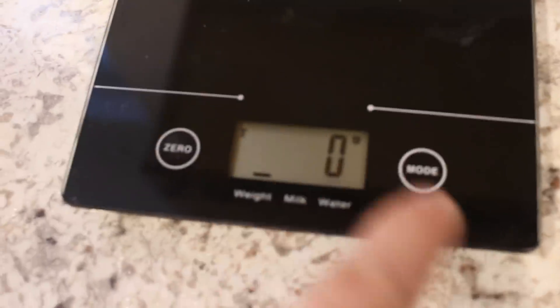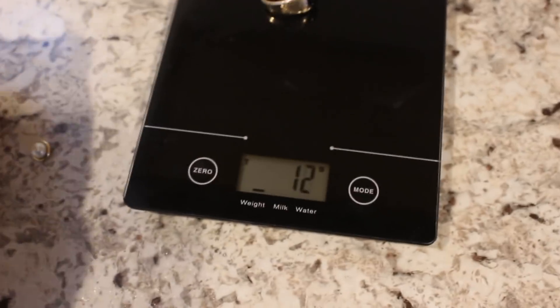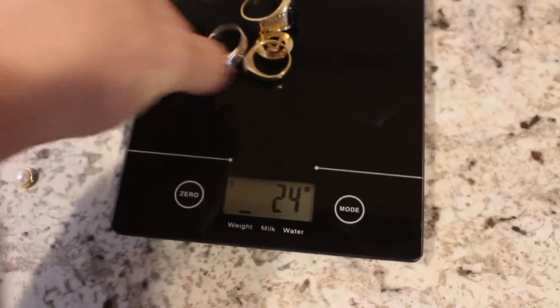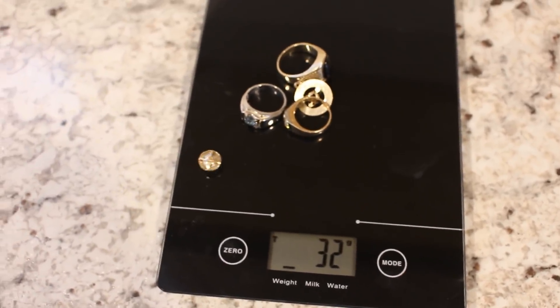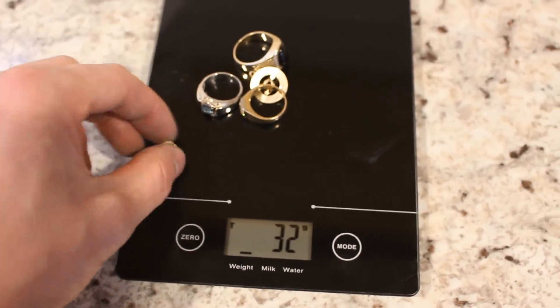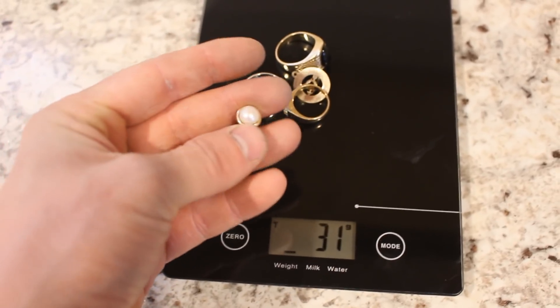So now it measures in grams, which is much more accurate than the ounces it was measuring in. I have here some gold jewelry, which I'll weigh up. You can see I've got 32 grams of gold jewelry here, which is 14 karat, and that's of course including the gemstones. So I guess the first thing I need to do is get rid of those stones.